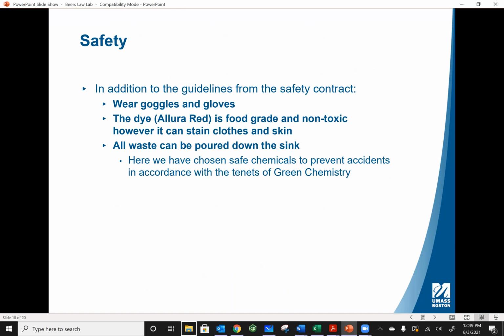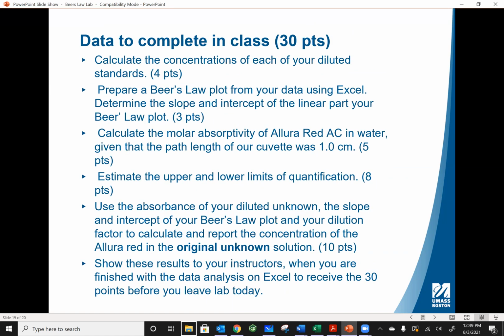Okay. Safety: gloves and goggles. In this one, all the waste can go down the sink. So today we just have the data sheet, so you won't be handing in a report, just filling out the data.